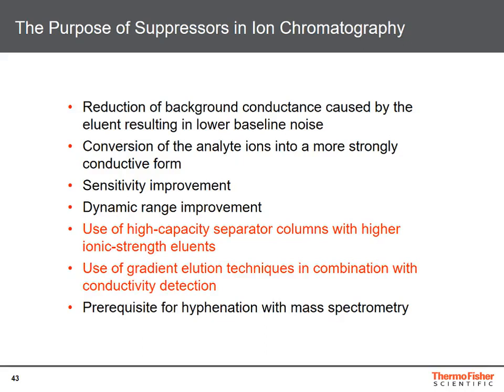Whenever I'm using high capacity separator columns in anion or in cation exchange chromatography, we must have a suppressor system in the system. Also, whenever we want to use a concentration gradient in combination with conductivity detection, a suppressor is mandatory.